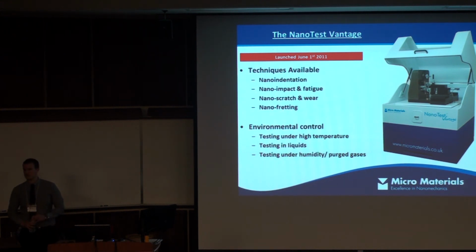Well, about the structure of the sample, one thing is if you have a sample that is completely homogeneous, it's easy to see the correlation between the fracture. I personally haven't worked on anything like that.